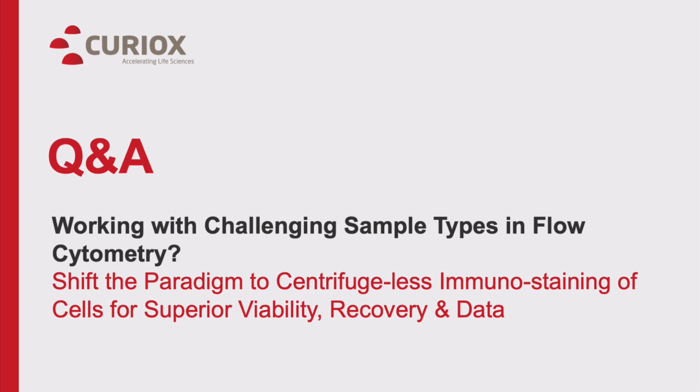We have 2 of the same question. Impressive presentation. I'm now terrified to centrifuge. Could you please provide a ballpark idea of how much the Laminar Wash HT2000 costs? Sure. So the HT2000 approximately, again, depending on options and what you get, it's approximately $60,000, $60K plus or minus. So I hope that helps. I'm glad I terrified you, because I'm terrified now too for centrifugation. I never really realized what I was doing to myself.